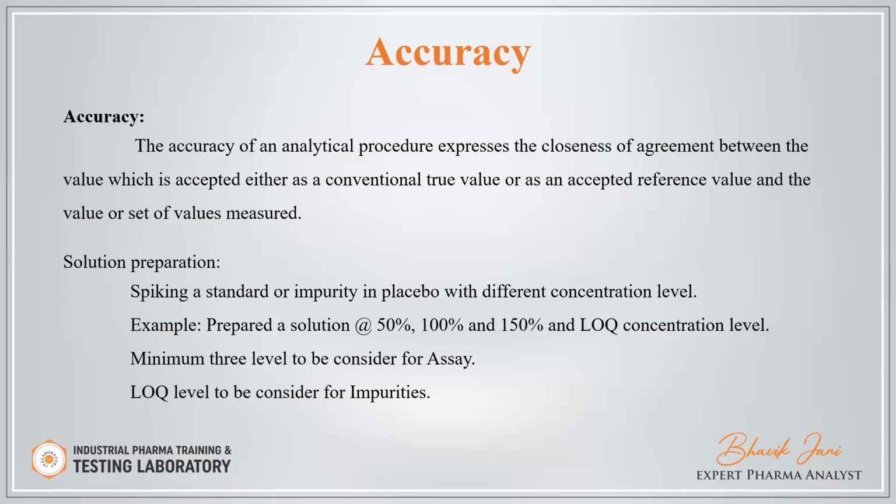Now the accuracy. The accuracy of the analytical procedure expresses the closeness of the agreement between the value which is accepted, either the conventional true value or an accepted reference value, and the value found. Solution preparation: spike a standard or impurity in a placebo at different concentration levels.